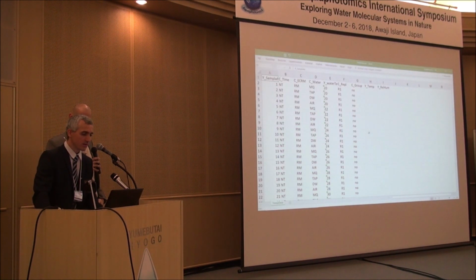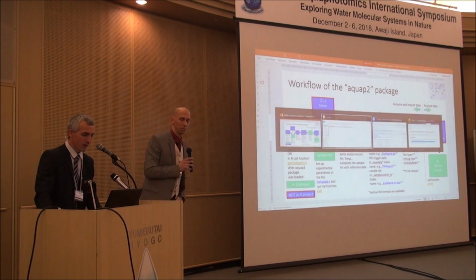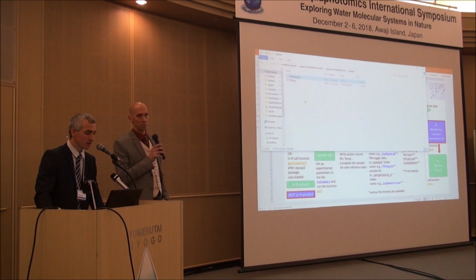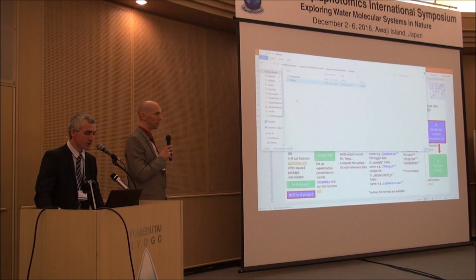You modify the sample list because probably you provide some more reference data like concentration of something, or you add additional variables, and then this file has to be copied to the sample list in folder as we did already for today, and then you copy your raw data containing the collected spectra, which can be in very different file formats, and you copy here your temperature logger data if you have one, and you are set.